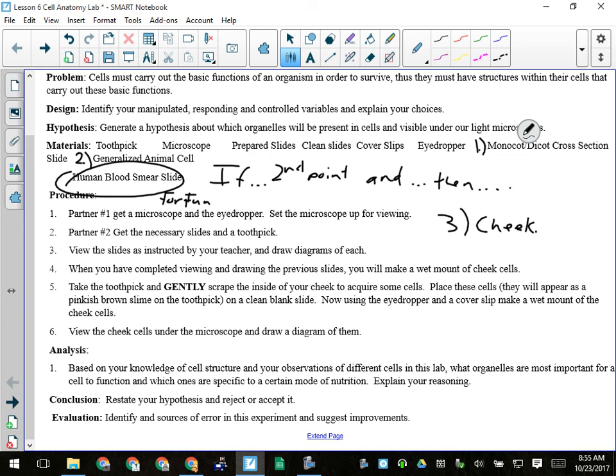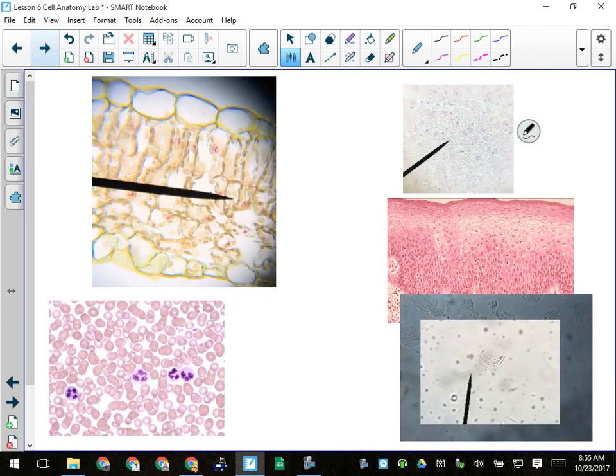So when we're looking through the microscope, generally, this is some pictures I took a few years back, but I have like a 4K video now for this one that just came up this morning. So when you're looking at the plants, this is what you're going to see. When you have the slide for the plant cell, there'll be the circle here in the middle. There will be 2 kind of things like that on the slide.